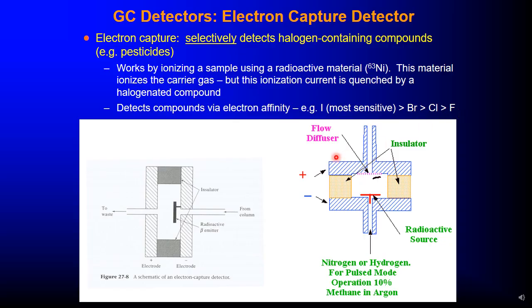Then you can be able to see a model or a schematic of an electron capture detector. So that is how it looks.